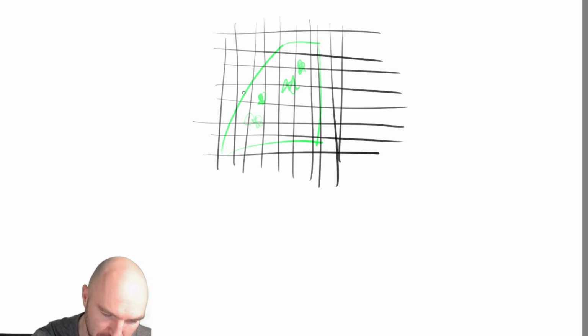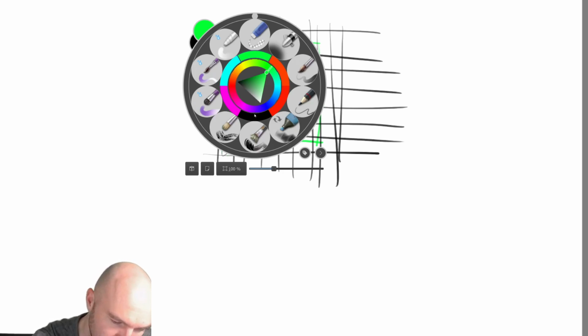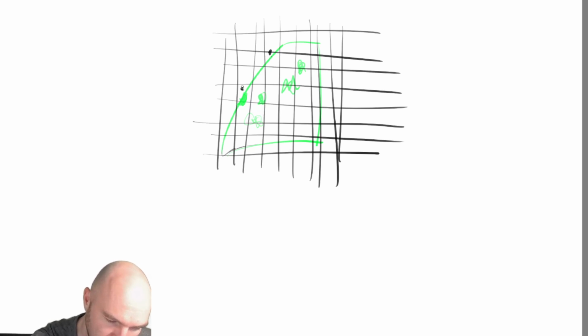And some of those voxels are partially inside the data set. That's why it's also very nice to know where the hull is. I haven't implemented anything that explicitly says, okay, that's the end of the data set, don't put any vertices there. We can actually see that if we have a high value here, it might put one of the vertices of our isosurface, maybe I should draw one that's actually near the boundary. So maybe we have a data set here, maybe we have a precipitate here. So one of our vertices might be outside of here.